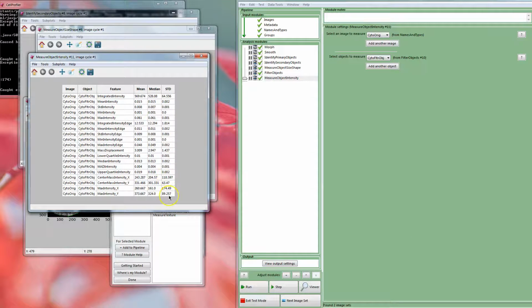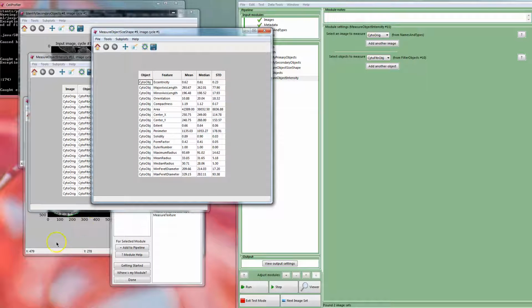And so we've got a bunch of different numbers from the intensity measurements. One thing you need to know on the standard settings for CellProfiler, the intensity measurements are given in terms of percentages of the maximum. So if your data is 8-bit, the maximum value is going to be 255, and it converts the values. Let's bring one up here.